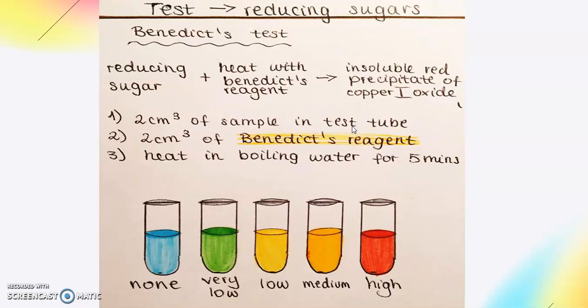This is called a water bath, because sometimes students are asked how to safely test for the presence of reducing sugars. This is a safety measure as well, because an open flame may be dangerous.